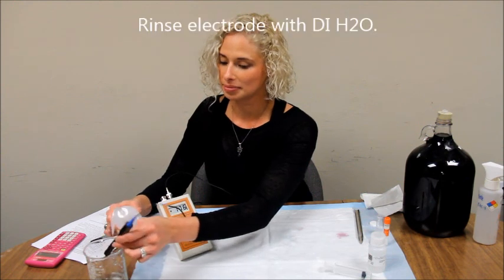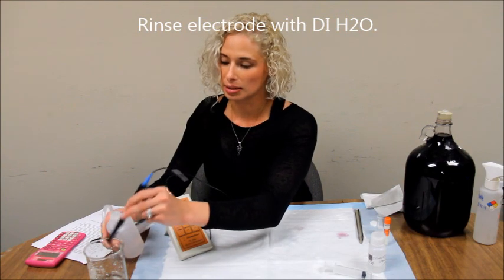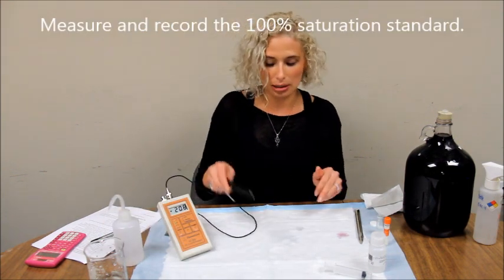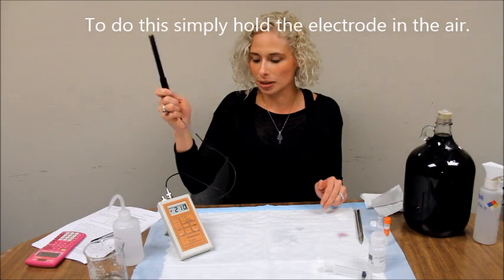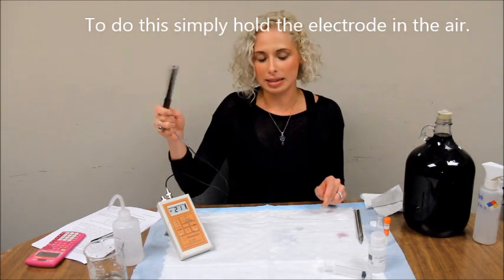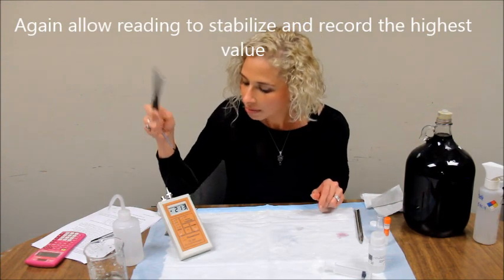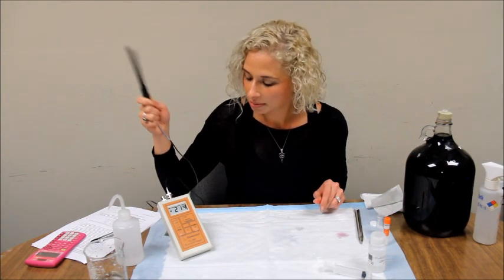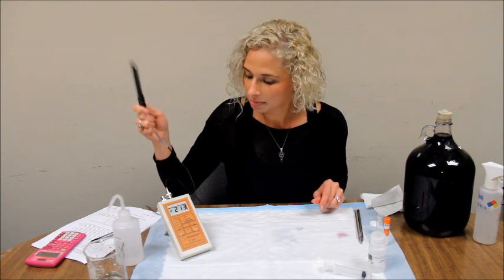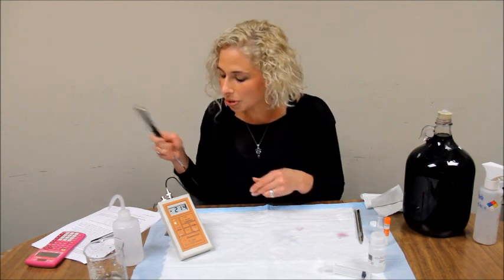Rinse off your electrode with distilled water. Now measure and record your 100% saturated standard. To do this, all you need to do is wave the probe in the air, exposing it to oxygen in the atmosphere. Allow the reading to stabilize. I'm going to call the value 214.